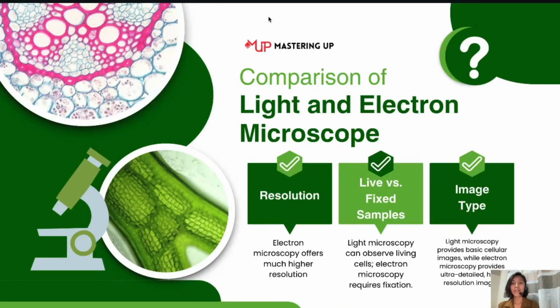So let's quickly compare light and electron microscopes. Light microscopes are great for observing live cells. They're easy to use and cheaper, but they have a lower resolution, meaning you can't see the smallest details. Electron microscopes are far more powerful. They allow us to see tiny details, even molecules and viruses. However, they are expensive, complicated to use, and can only be used with dead cells. Both have their strengths and are used in different situations depending on what scientists need to study.